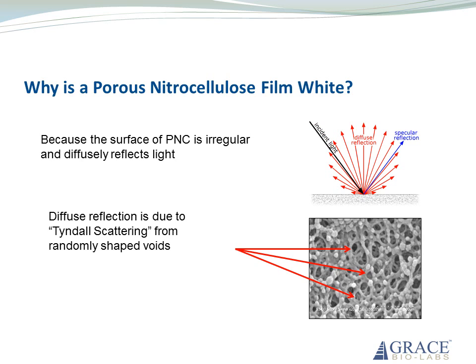Scattering amplitude varies both with the wavelength of incident light and with the size of the scattering centers. It is the very nature of this scattering that we can exploit when we perform our assays on PNC relative to clear films or glass.